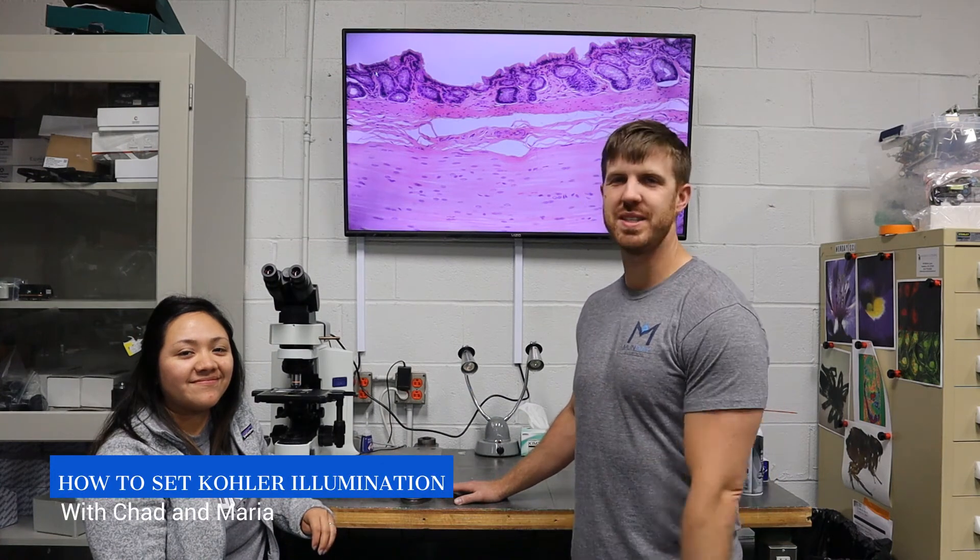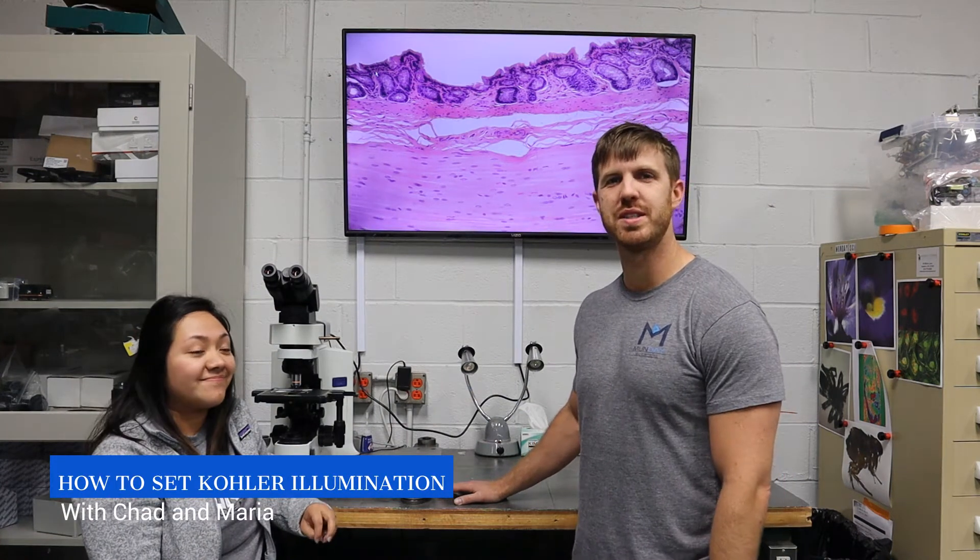Hey, this is Chad and Maria from Munday Scientific. Today we're going to show you how easy it is to set Kohler illumination on your microscope.